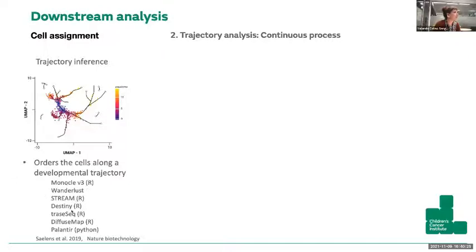So there is different packages to use trajectory analysis. There is actually quite a lot. So again, I put a review here if you want to look at which ones are the best performing packages, which I think they do also systematic comparison. Monocle 3 is quite widely used, and it has a very easy plugin with Seurat. So it communicates with Seurat.